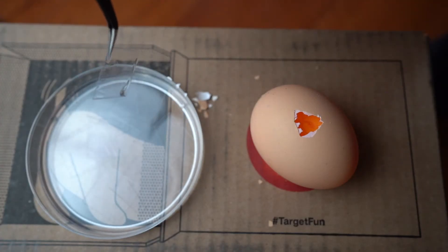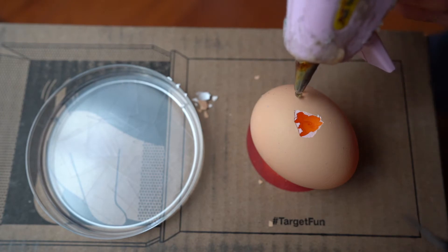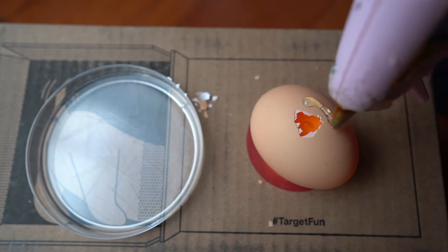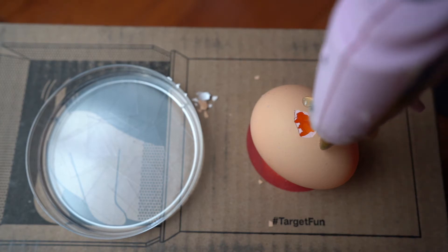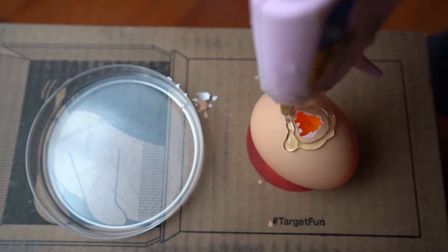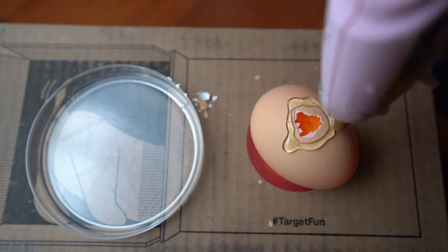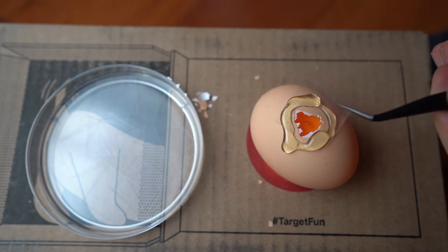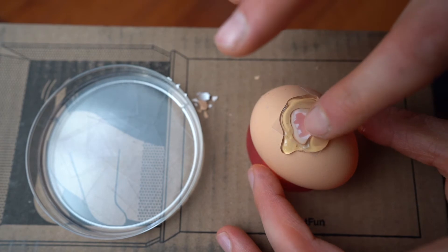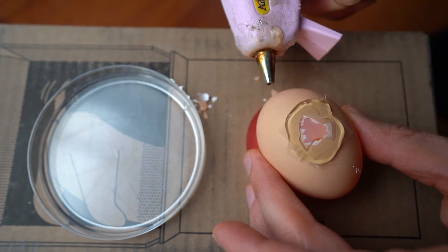Now I'm going to take a cover slip and let the alcohol evaporate off of that, and I'm going to get a bunch of hot glue. I want a decent amount of hot glue on here so I get a complete seal with the plastic cover slip and the egg so I don't allow any of that moisture to escape. Place that on top, kind of smoosh it down to make sure it makes contact all the way around and make sure there are no gaps in this whatsoever.